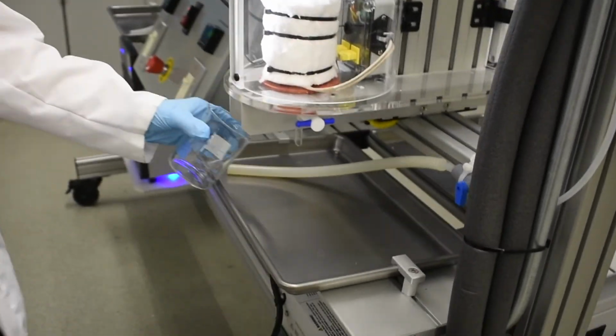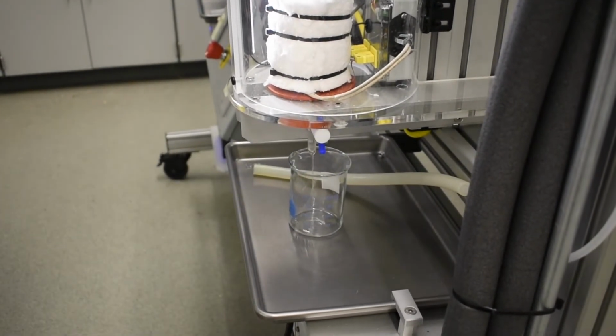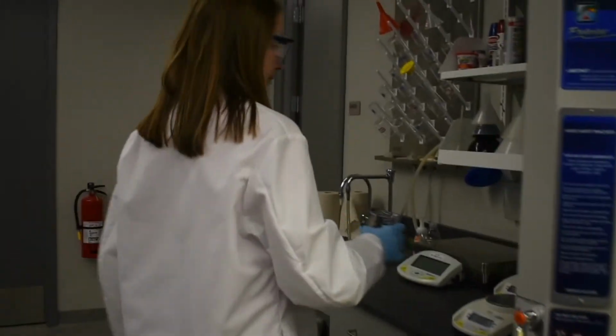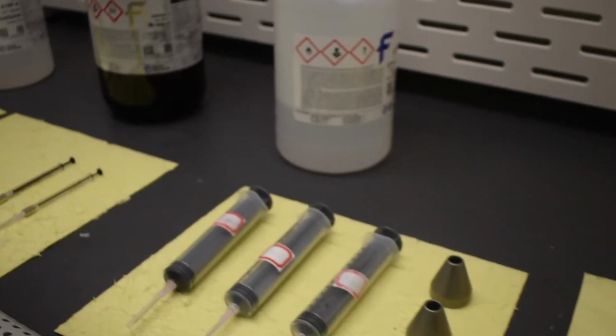Once all of the injections are complete, tare an empty beaker on the scale. This beaker will be used to measure the amount of liquid in the ebullirometer. Once the RTD reads below 50 degrees Celsius, open the stopcock and release the liquid. Record the mass of the liquid, then dump it in the waste container. When you are finished, make sure that the lab station is clean and ready for the next group to use.